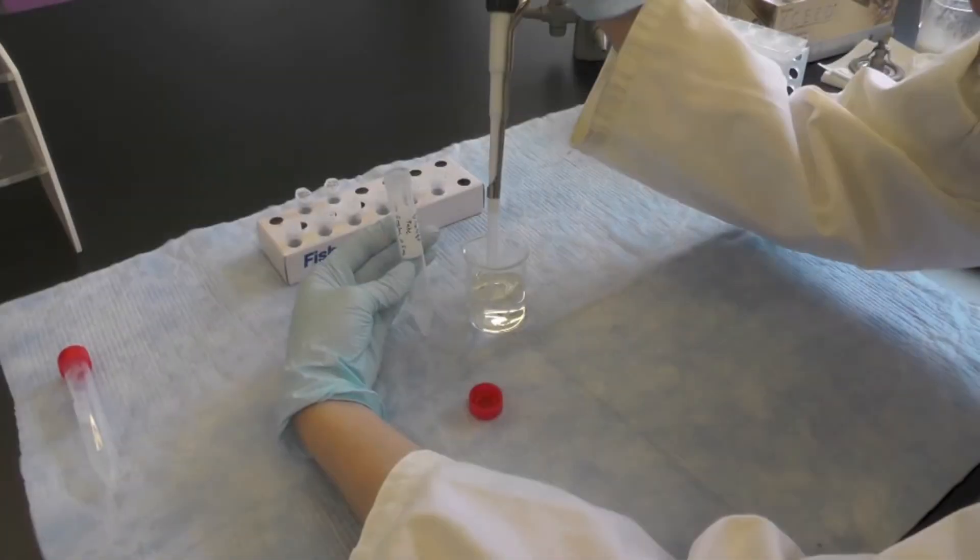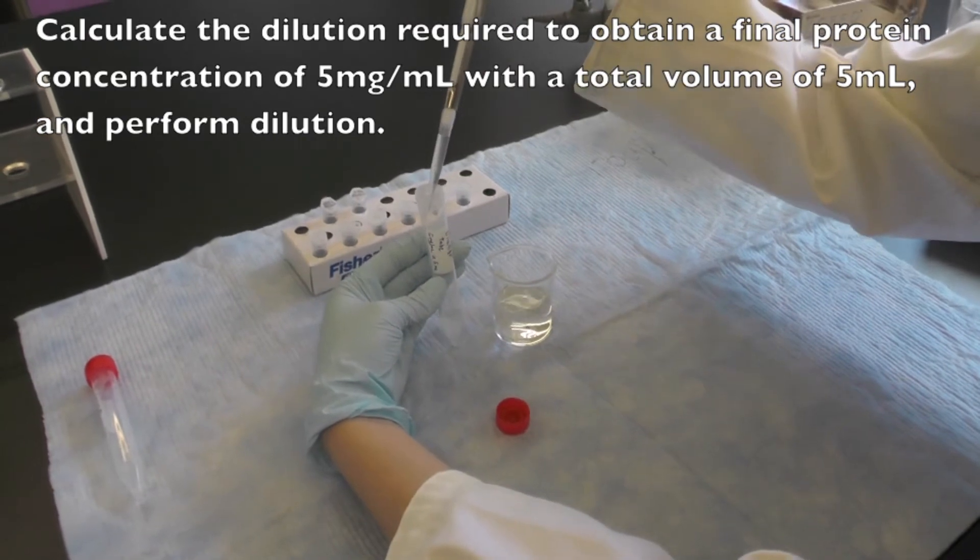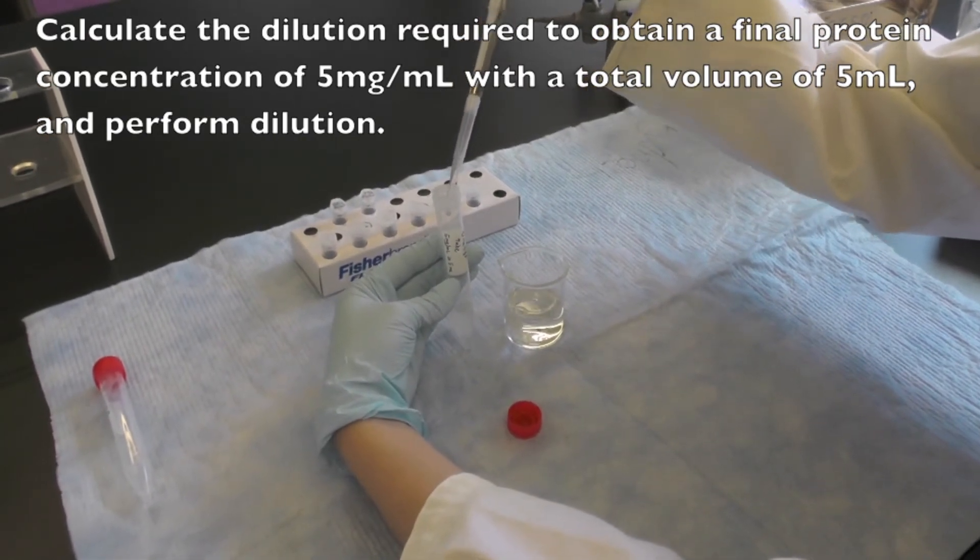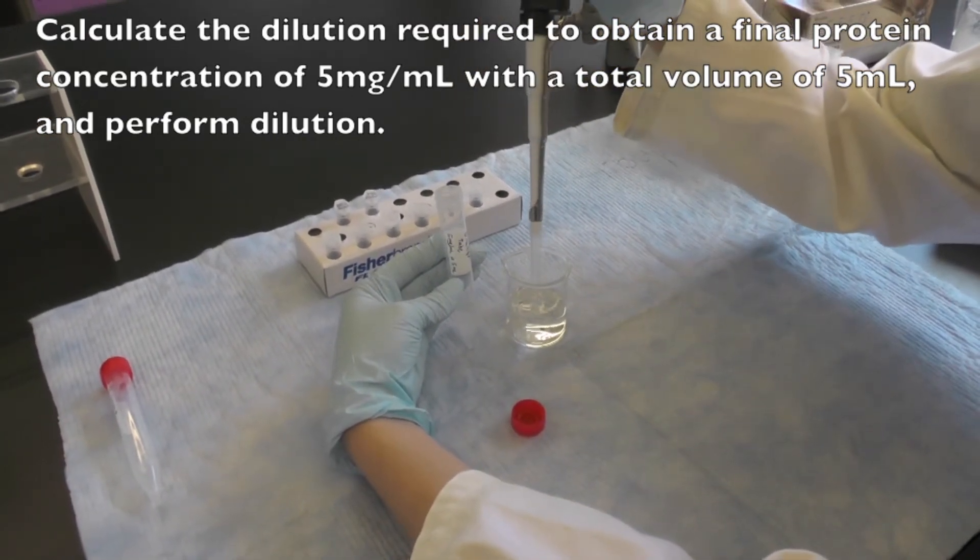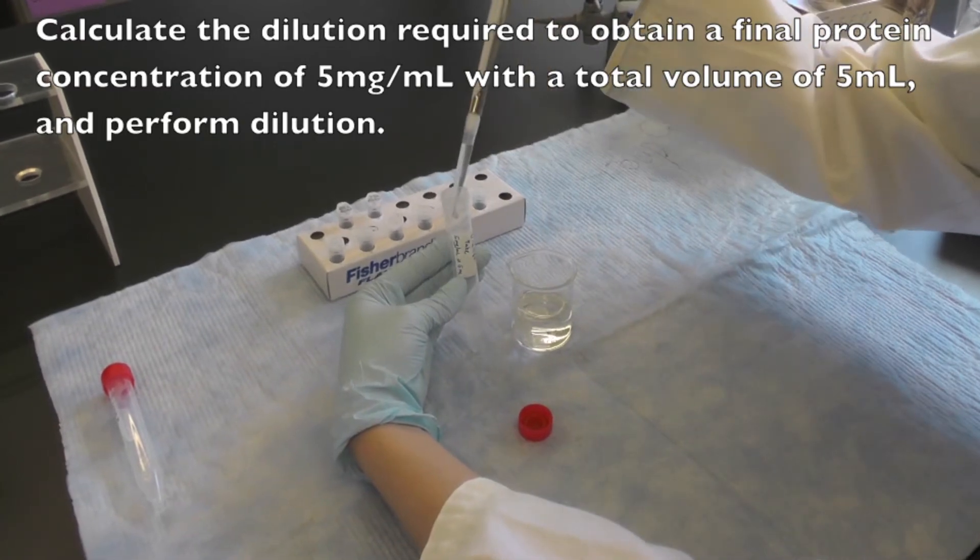Finally, calculate the dilution required to obtain the final protein concentration of 5 mg per mL in a total volume of 5 mL. Use DD water as your diluent.